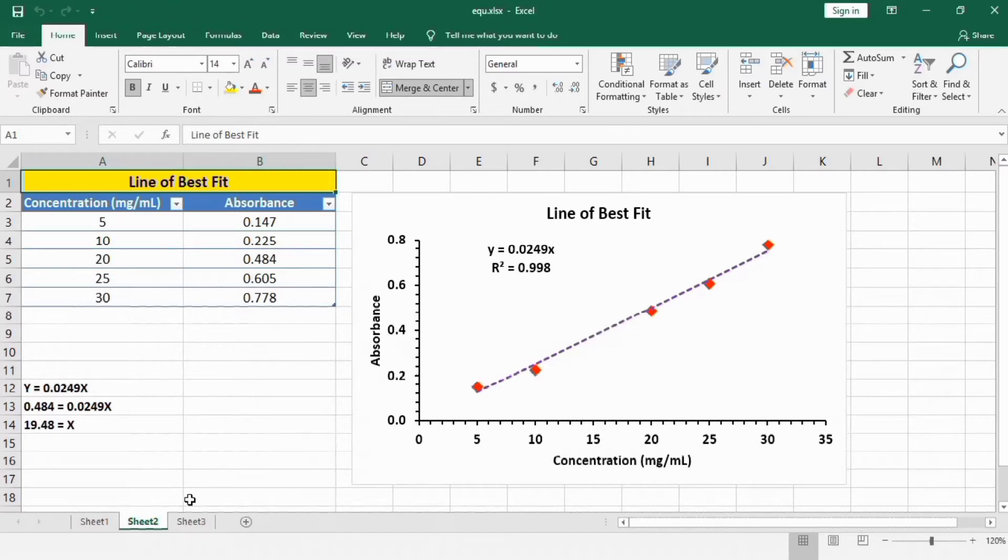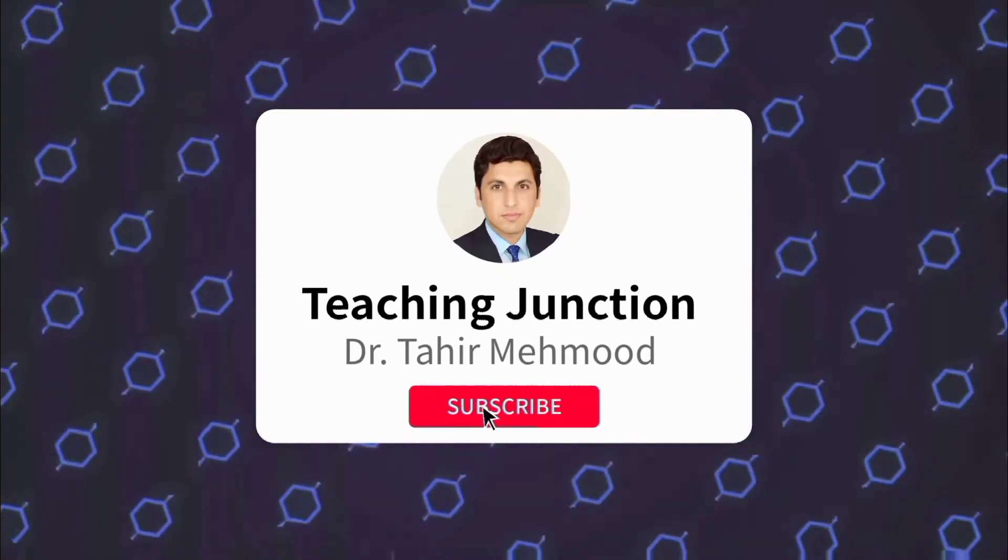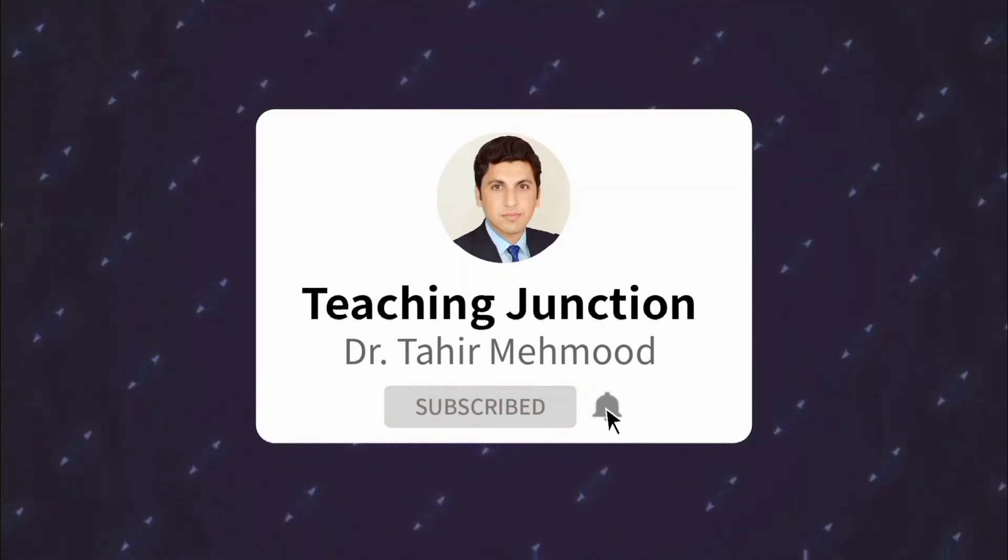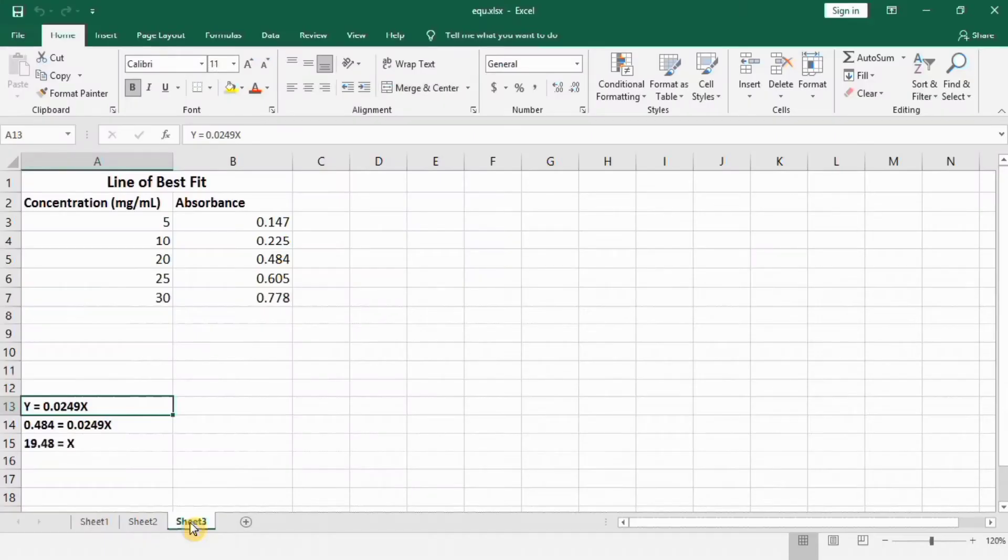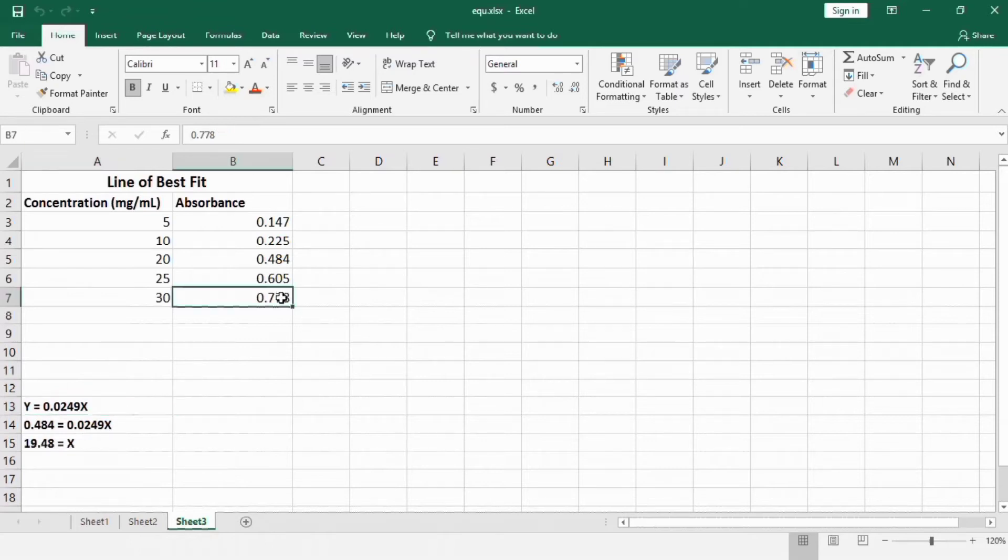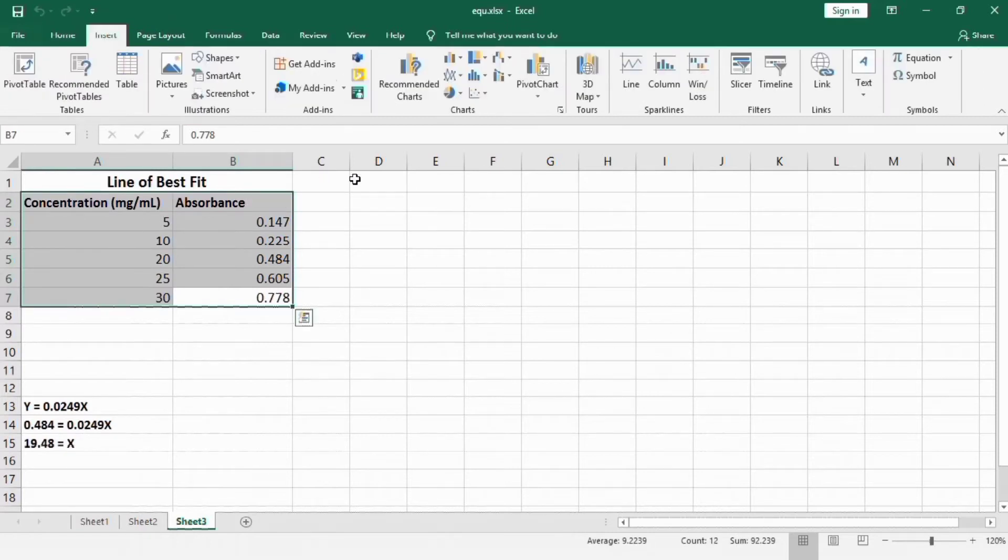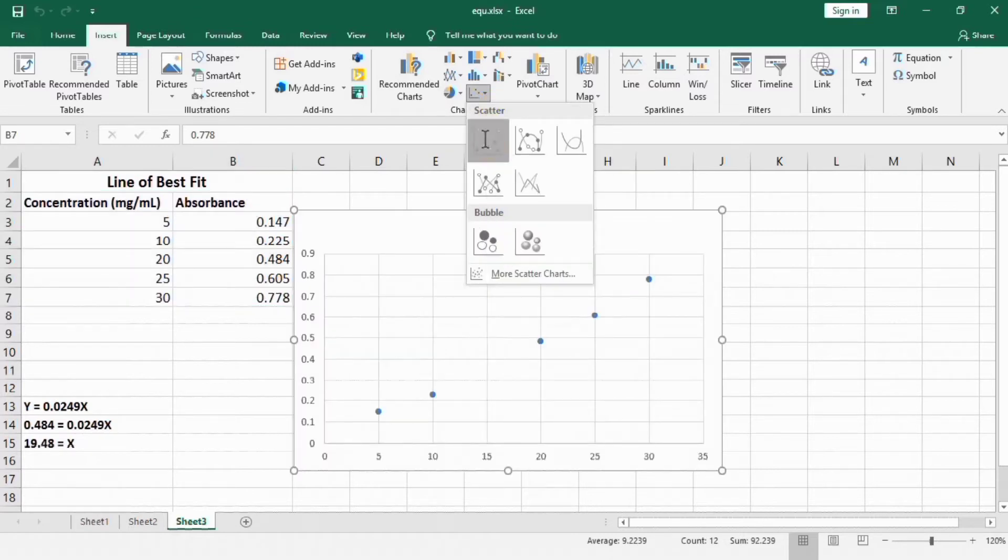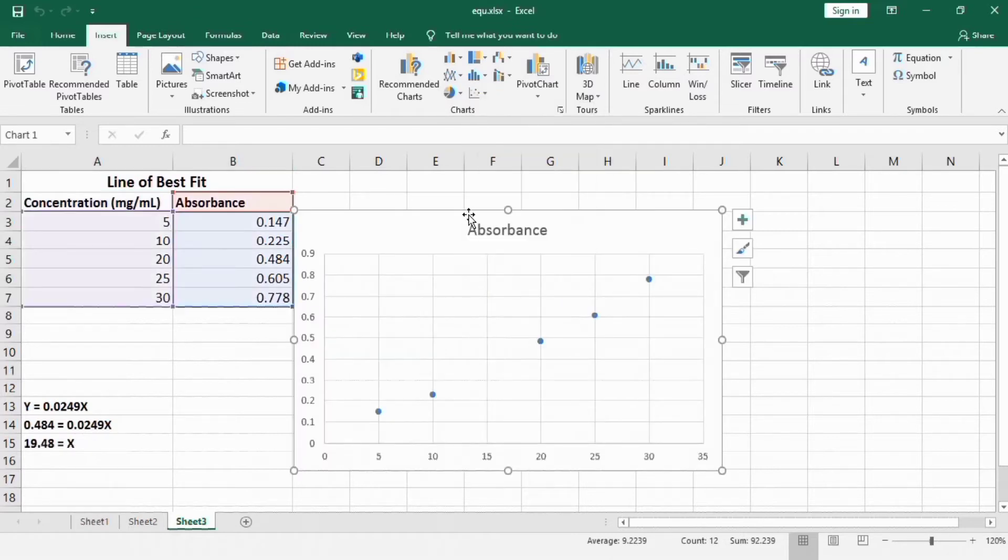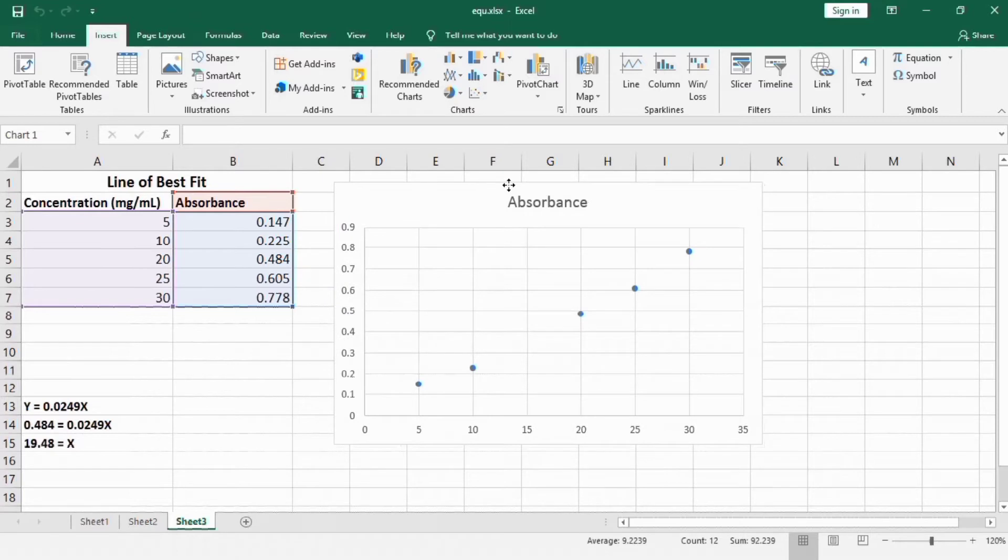So let's start this tutorial. First you have to select this data, go to insert tab, and from here you will find the option of scatter plot. Select this one. Now resize it.